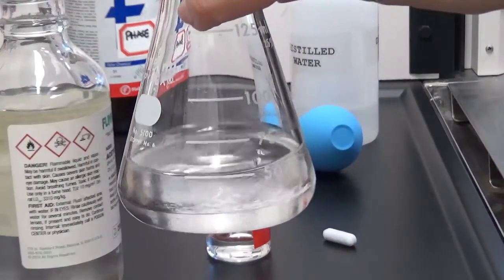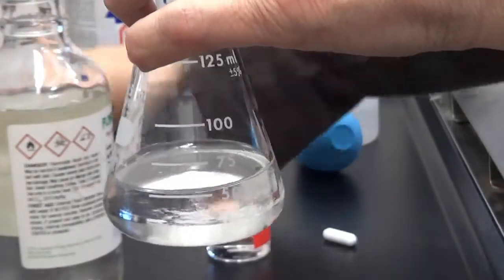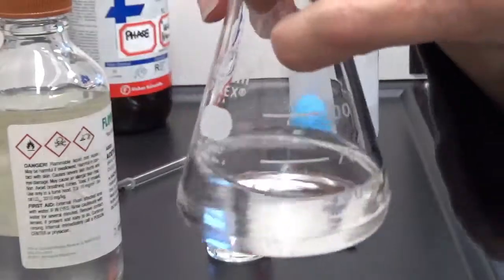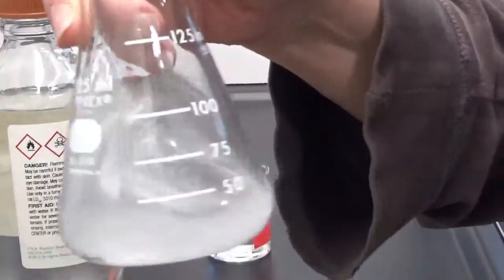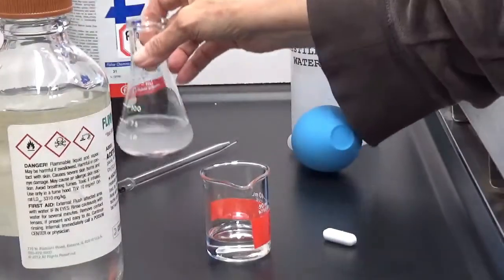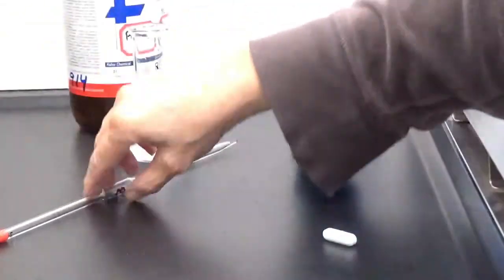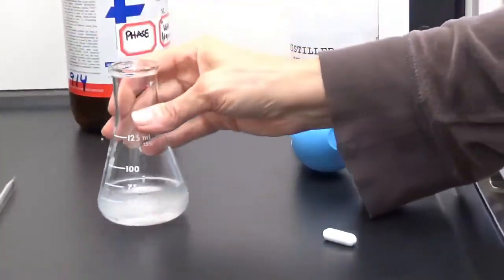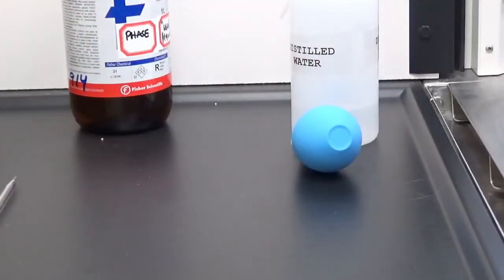So what I'm going to do is mix it up, and then I'm going to separate the layers. Now, why would I do that? Well, what I want to do is figure out what is the composition of each layer. Okay, so I'm not so interested in the overall composition. I want to know what's the composition in the upper layer and what's the composition in the lower layer. So I'm going to stir this for a while. Let me get that going. I'm going to do it in the hood because it's rather smelly.